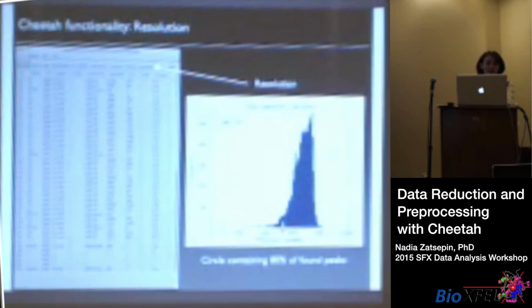Now, since I don't know the detected distance for this sample or wavelength, I can't tell you what this means. But that will also show you if you have a heterogeneous quality distribution, and maybe if you have enough data for that resolution later.